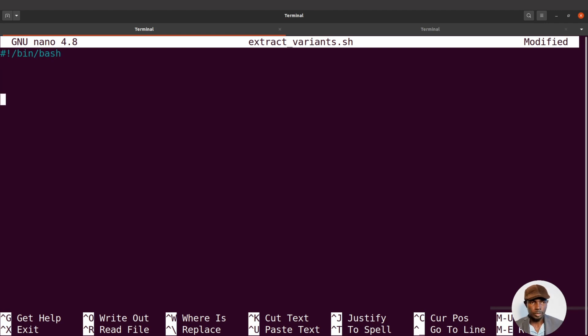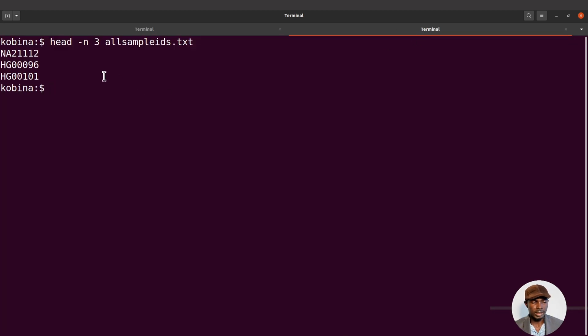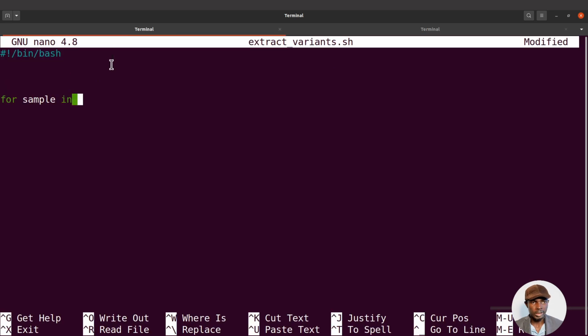And then the next line, I'll proceed. I'll say for sample in, and then I'll just copy them here. Let me paste them one by one.